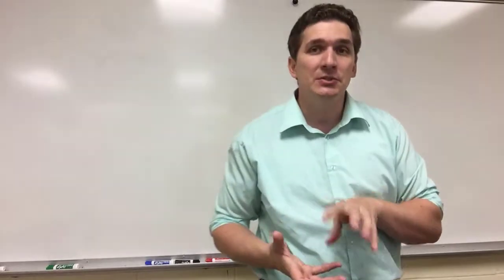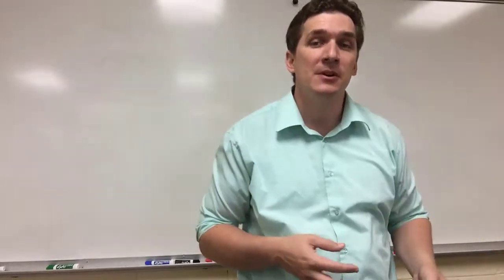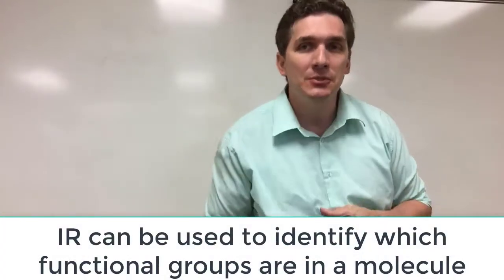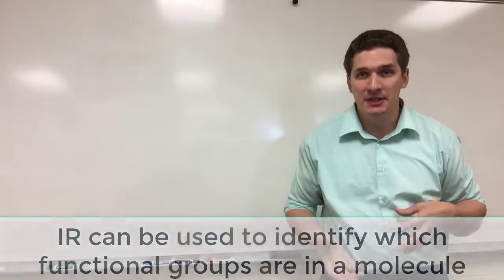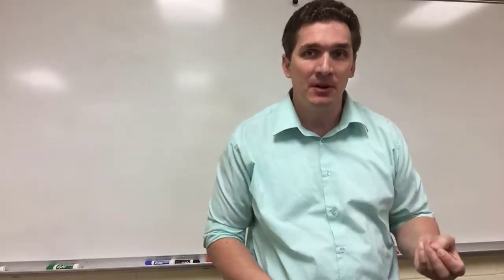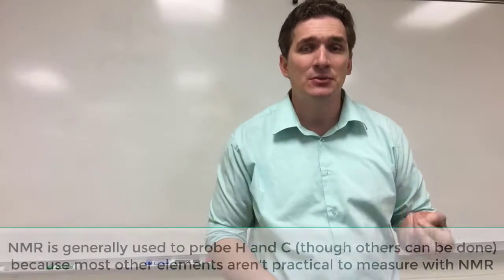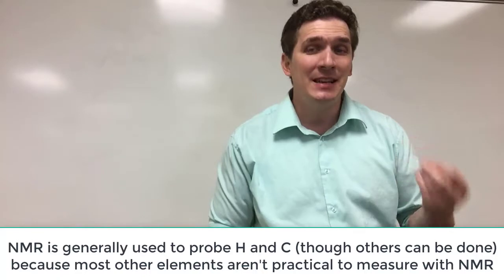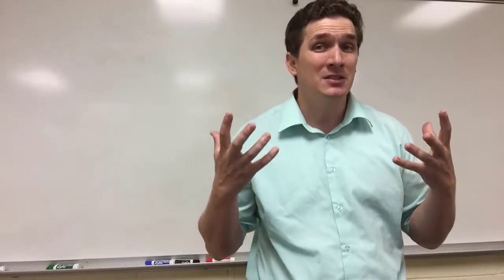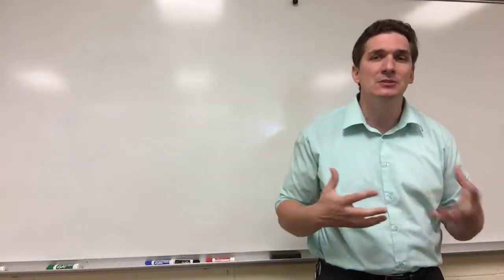Practically, what we're going to do is use FTIR to figure out what functional groups are present in a molecule. And this is going to be complementary to the mass spec and the NMR data. See, the thing with the NMR is that there is oxygen NMR, and there are halogen NMRs, but they're prohibitively expensive. Something like oxygen-17, the only NMR-active oxygen isotope, costs thousands and thousands of dollars just for milligrams of it. So we typically don't do it.